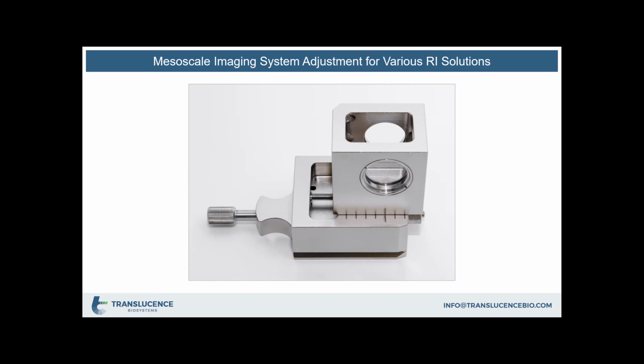And in fact, we recently, before UBC purchases, we had one of Maywich's beautiful samples from using the LifeCanvas tech solution, which I'll say works really, really well. And we imaged that here. I would show the images, but they weren't ideal because we weren't used to handling those tissues, and they're a little bit squishier than our gummy bears. Their gummy bears are a little bit softer, and we got a couple of air bubbles in there, so it doesn't look ideal. But certainly, this works beautifully for the shield samples as well.